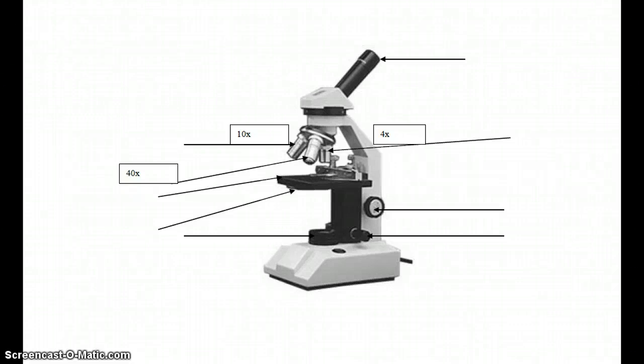Okay, so this podcast is going to cover the parts of the microscope, what they do, and how to use a microscope. We're going to practice this in class next time. This should be a review because you've already seen a podcast on microscope parts and uses earlier in the year, but this is just going to be a quick review because we're going to get to use them for a couple of days now.